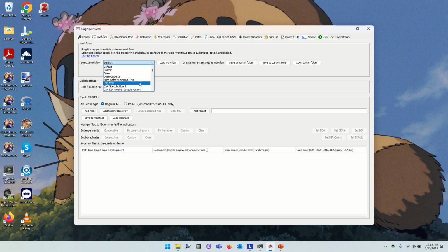This is based on the premise that a peptide may not be identified in multiple runs, but it may still be detectable in intact form in the MS scans. And so match between runs allows us to quantify peptides in an experiment, even if they haven't been identified there. So LFQ and MBR are quite necessary there.